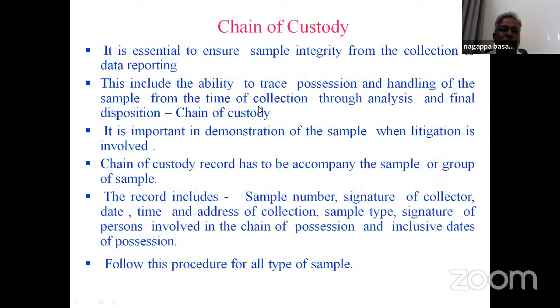Chain of custody. This is more important. If any legal issues arise, or anybody challenges our data, our sampling technique, or the integrity of the sampling process, chain of custody is very important. This is essential to sample integrity from the collection to the data reporting.